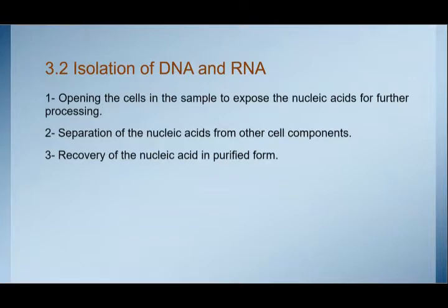So a variety of techniques may be used, ranging from simple procedures with few steps up to more complex purification involving several different stages. These days, most molecular biology supply companies sell kits that enable purification of nucleic acid from a range of sources.